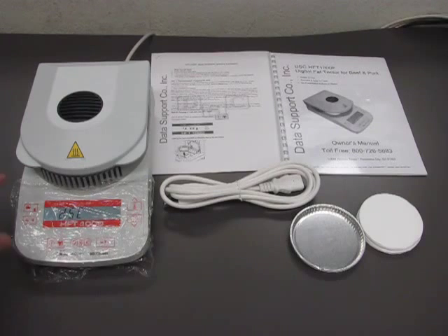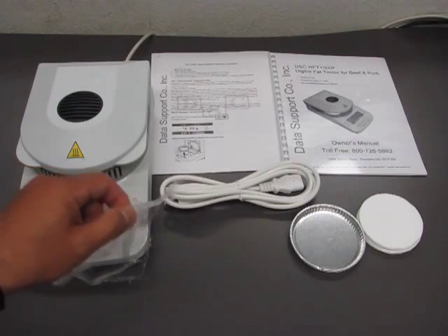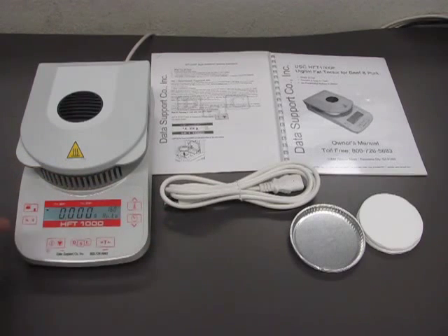By the way, you will note that the unit comes with a protective cover for the keypad. You are not supposed to take off that protective cover. All you have to take off is the thin plastic that covers the plastic sheet that protects the keypad.